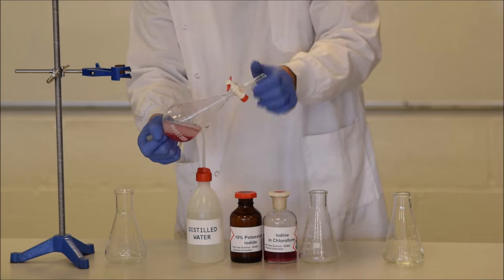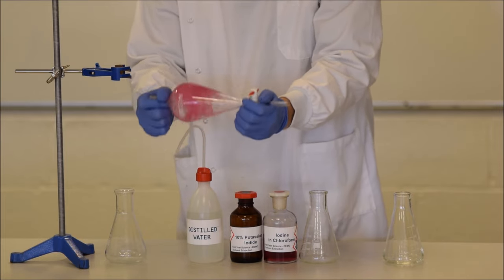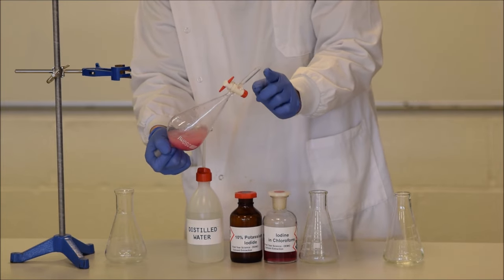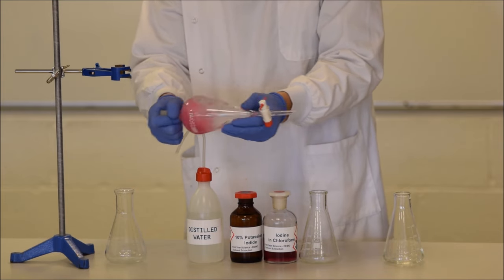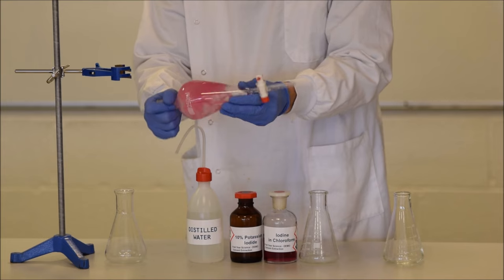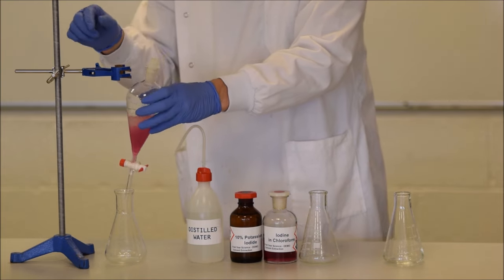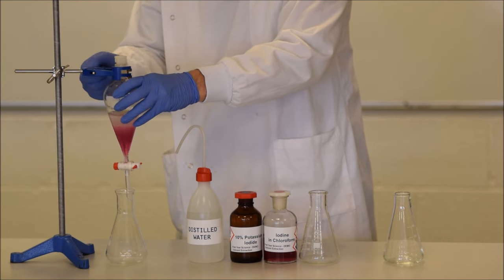And when you're venting it, make sure that it is not pointing at anyone or anything within the lab, because some liquid is going to come out of it. Not very much, but you certainly want it not to go towards somebody's face or eyes, or onto anything that might be of value or might be taken out of the lab. So just be a little bit careful when you're doing that. Once you've given it a good shake, check the stopper comes out and there's not too much pressure in it, and then you can clamp it again and wait for it to separate out.